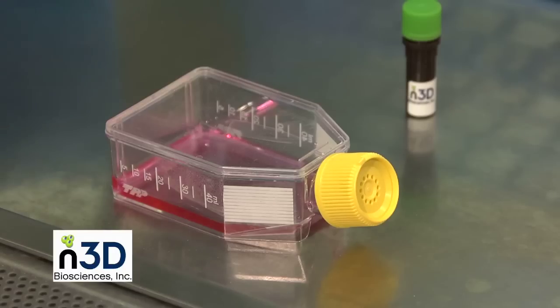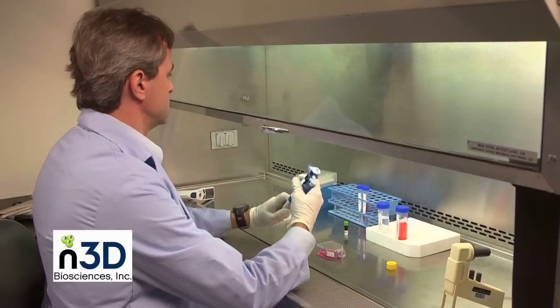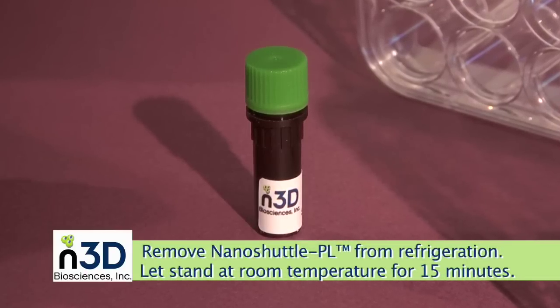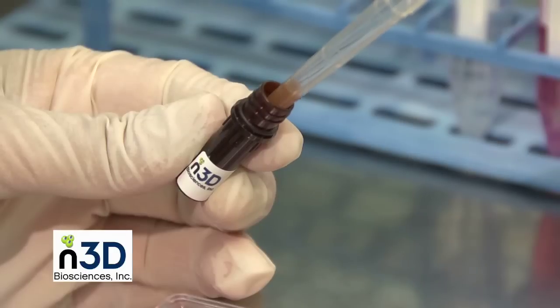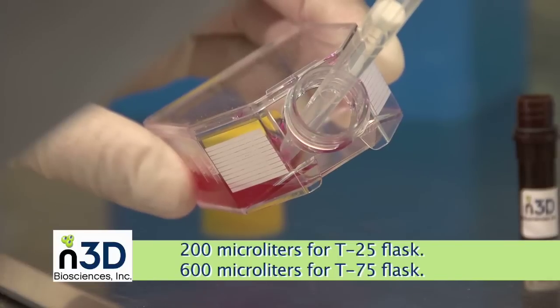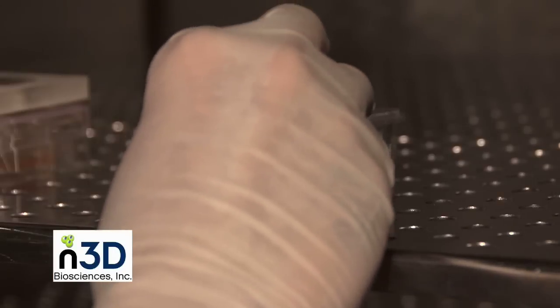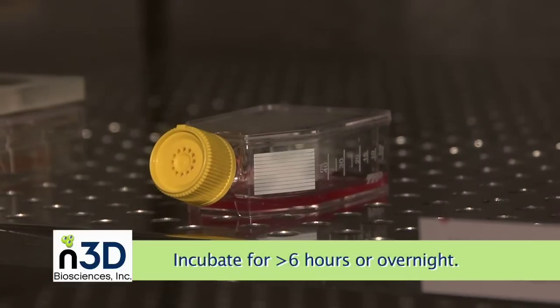Start with a flask of your cell type in whatever media you typically use and culture the cells to close to confluence, following your standard culturing protocols. We first treat the cells with NanoShuttle PL reagent to introduce a small amount of biocompatible magnetic nanoparticles to the cells. Homogenize NanoShuttle PL in its vial by pipetting it up and down at least 10 times. Add NanoShuttle PL and gently agitate the flask to evenly distribute. Place treated cells into the incubator for at least 6 hours or overnight using your lab's standard cell culture incubation conditions.